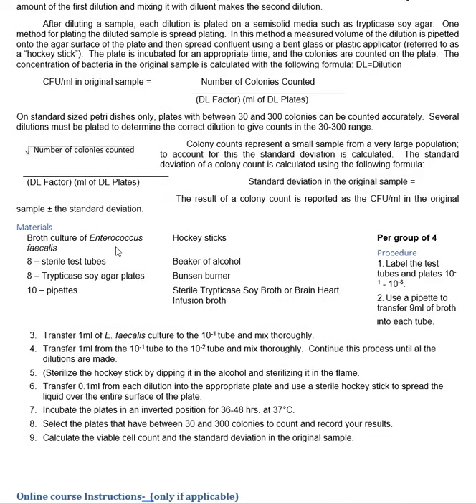So if we were doing this in the lab, we'd use Enterococcus faecalis, normal flora in our bodies. We'd use those pipettes and the hockey sticks, and use alcohol in order to do this aseptically. When I need to, I dip the hockey stick in the alcohol, shake it off, and put it in the burner to burn all the alcohol off, because alcohol kills bacteria. Let it cool because heat kills bacteria, and then spread it out. And then in between each plate, I'd have to do that in order to keep from messing up my count by introducing additional bacteria.